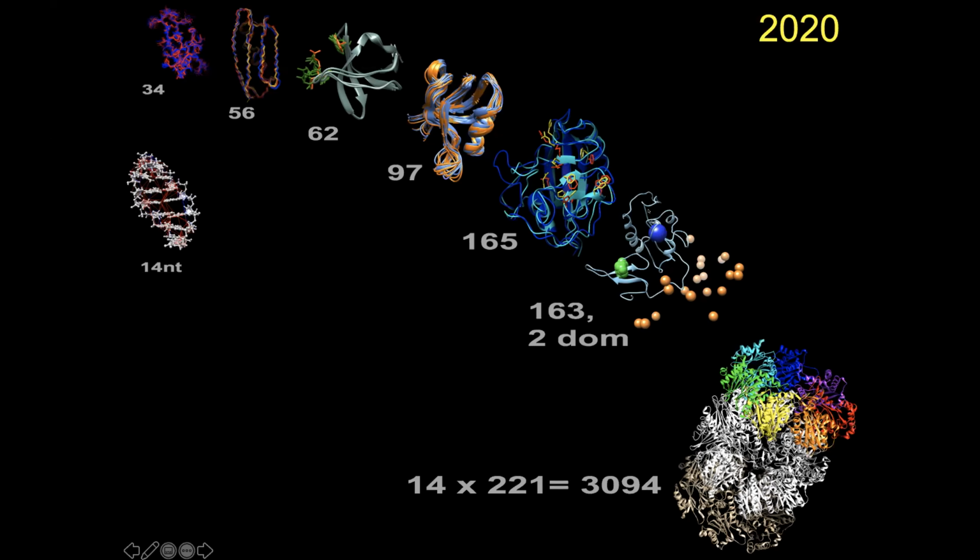And a second very interesting thing we started to investigate is the application of the same protocol to nucleic acids. This is our first test case. That's a 14-mer UUCG tetraloop. It's an RNA that is very well studied in NMR, so it was a great test case for us. Currently, we're also extending the methods to DNA and to more challenging RNA molecules.